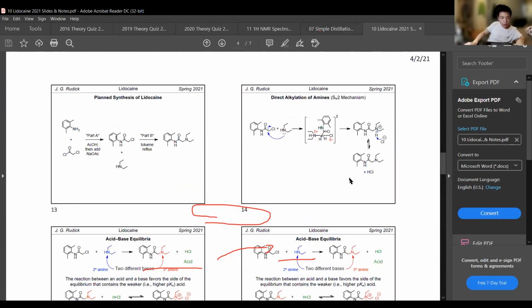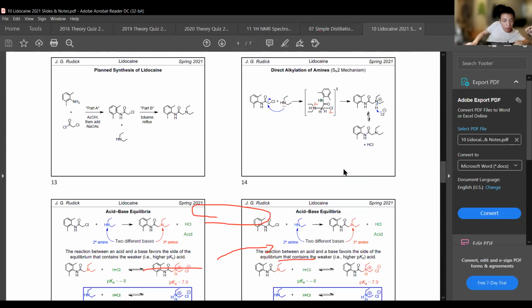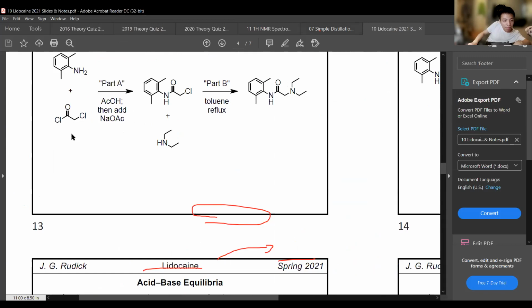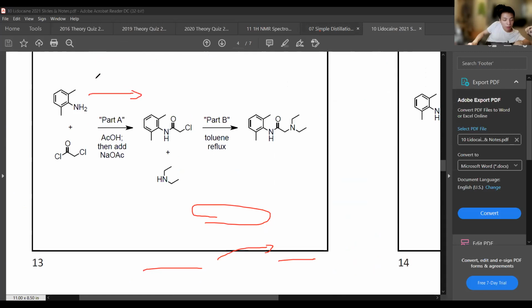And then for why we have to remove all of them, maybe this one is true. I don't know, this one is kind of confusing. That one is soluble in toluene.